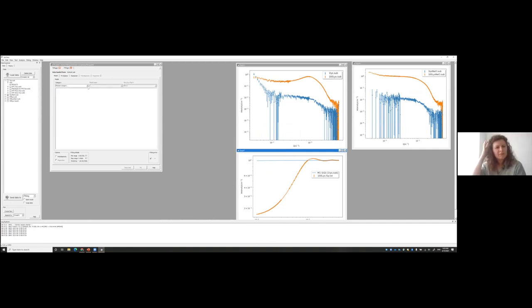Hi, Susana, I have a quick question. So I followed through the tutorial, doing all of the steps exactly in order. And I have slightly different values for the polar radius than in the screenshots. Is that bad? No, that is perfectly normal. In this case, we're not fitting a lot of parameters and we fixed a lot of them. So they probably will not be too different.